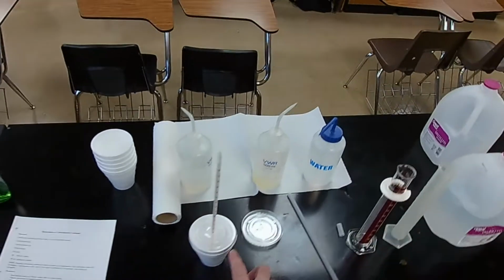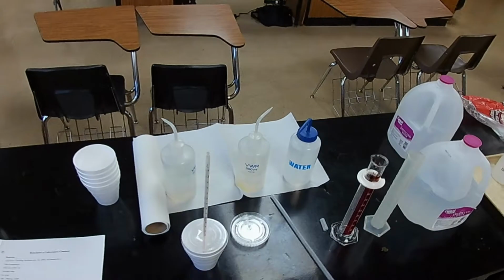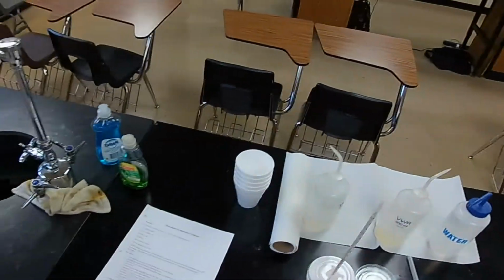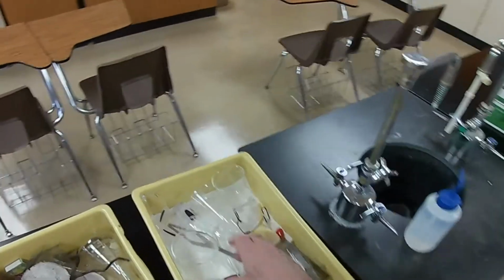I used to have a stirring device in there, but it complicated things just too much. We're going to use the thermometer to stir. One other thing we need: something to hold the calorimeter to keep it from tipping over.